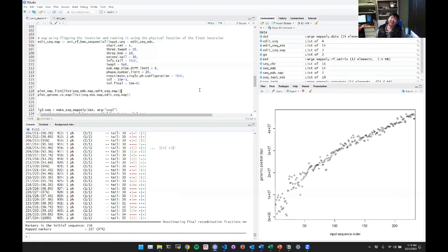What I have found typically, if you use map poly and there is an inversion like what we just saw, the reason that inversion is there in the reference genome is because when they were assembling it, there was the same statistical likelihood that it was ordered one way versus the other way.